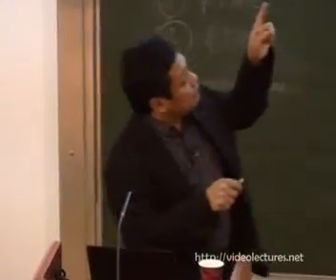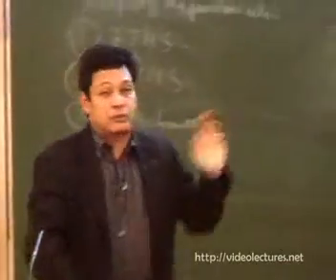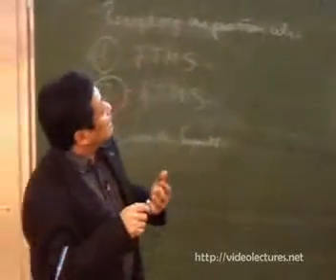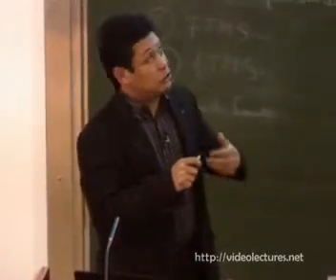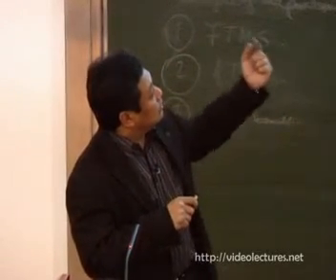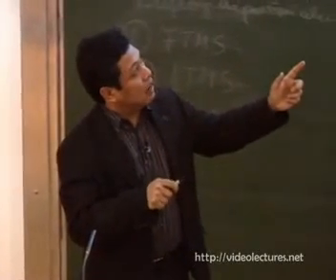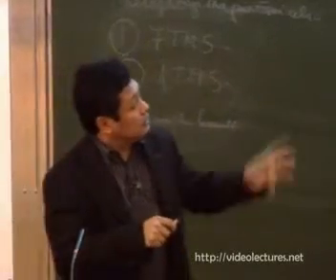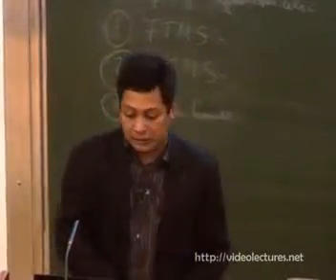An interesting thing is, if you look at the width, this one is narrow and this one is large. Larger width means stronger interactions. Narrow width means weaker interactions. As expected, far away should have weaker interactions because the dz² orbital, which is one of the main contributors, is now far away from the substrate. In this case, it is in contact with the substrate. If we convert that to temperature, we get 130 Kelvin. This is the energy scale. You can convert that by kBTK. And this is 170 Kelvin. So a higher temperature means stronger interactions.